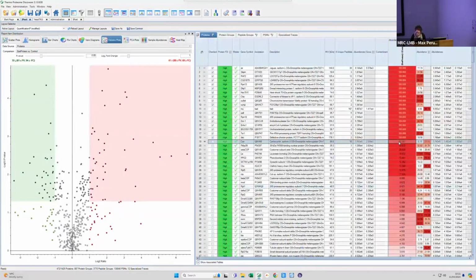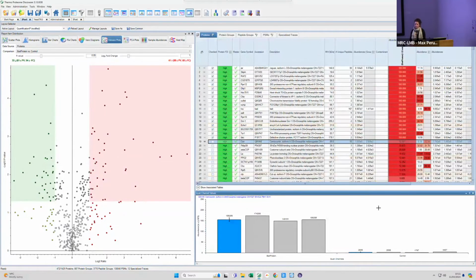Right, this one. Let's see how it looks. See, this is an example. It has been identified in both. It has abundance in both, but the difference in fold is so big, I would probably not say that this is an unspecific binder. It also binds your control, so probably it's binding something else that's in your antibody, your GFP or whatever. But look at the difference in abundance. I would still say that there's some specificity to your bait protein, so be careful with this.